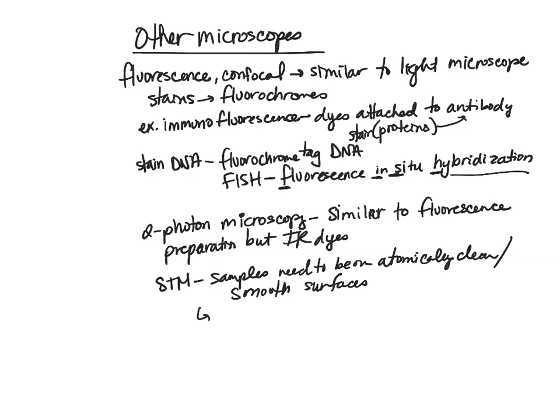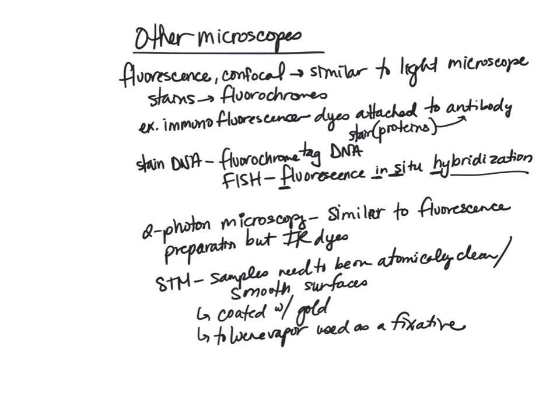Then they are often coated with gold. And then we have a toluene vapor is used as a fixative. All right, and then we can utilize the scanning probing.